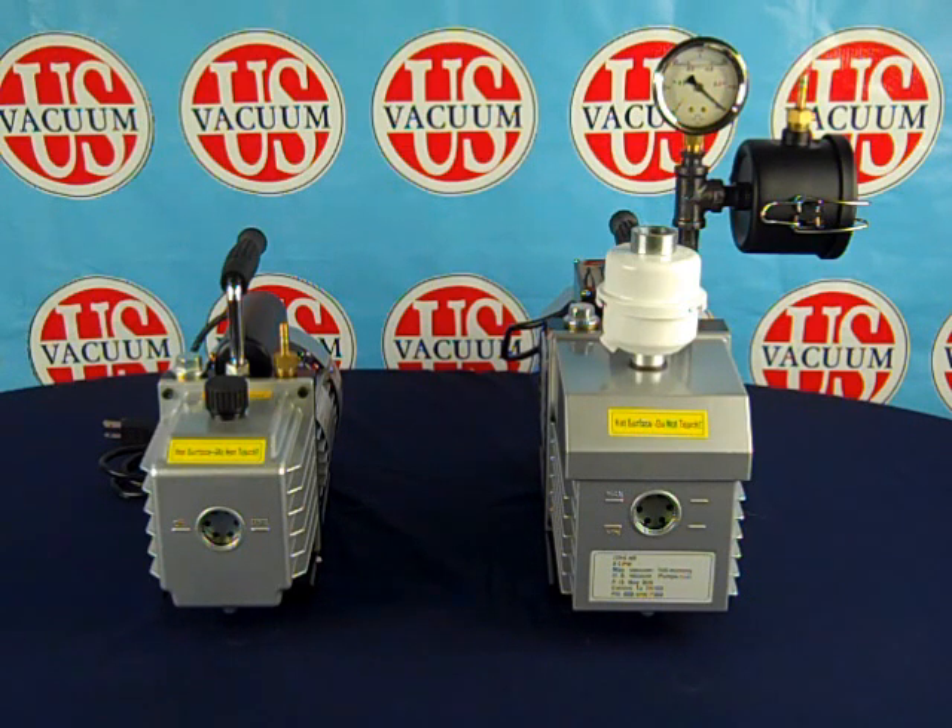On the right, we have our CPS pump packaged with accessory items. These accessory items include a discharge oil mist exhaust filter with coalescing element, a 0 to 30 inch liquid filled vacuum gauge, and a suction particulate filter assembly with 2 micron element. The discharge filter provides a clean, oil-free exhaust from the pump, while the vacuum gauge aids in measuring your vacuum process and in troubleshooting. The suction particulate filter protects the pump from foreign matter entering the pumping unit.